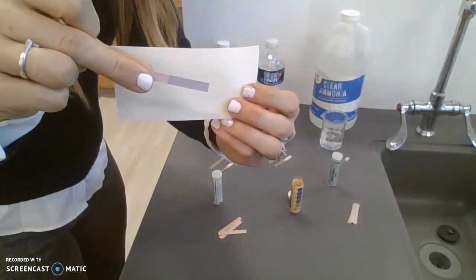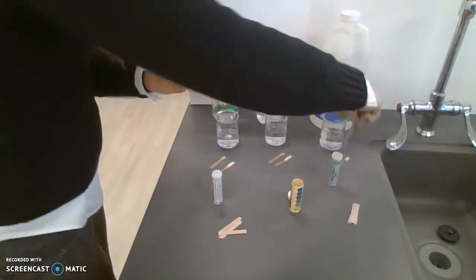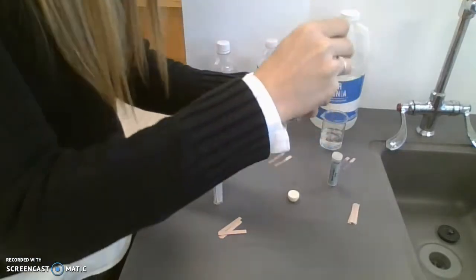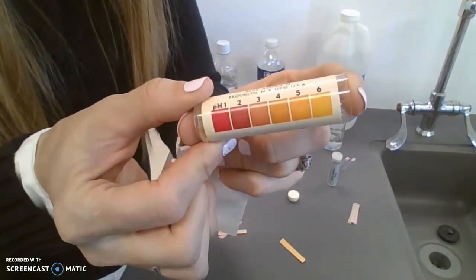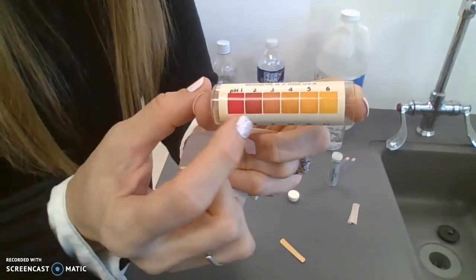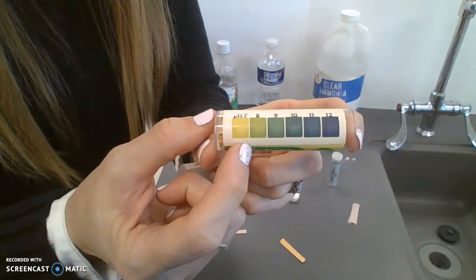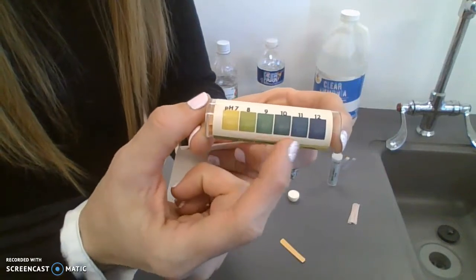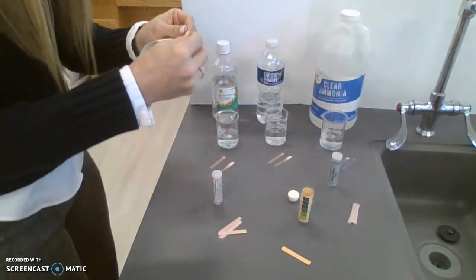Bases turn litmus blue. Bases are bitter and they turn litmus blue. So on this yellow litmus paper, we see a pH scale range 1 to 6, so it goes red, orange, yellow, and then a pH of 7, 8, 9, 10, 11, 12 goes from light green to blue to almost purple. We can test this.